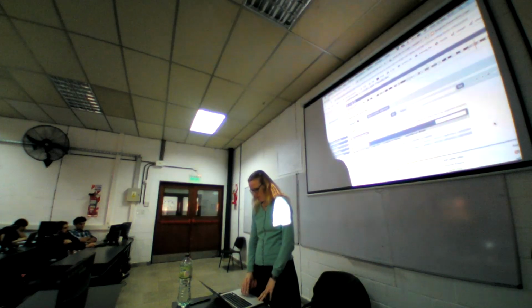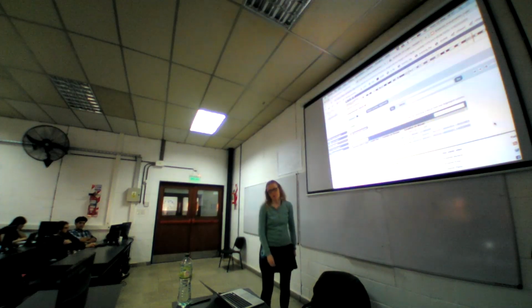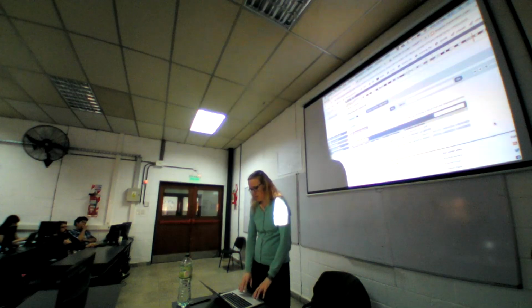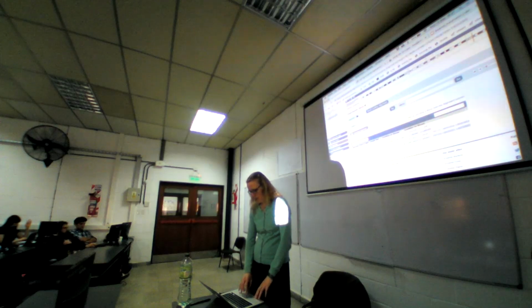And you can see that this region between human and mouse has an alignment, and it comes in 4 different blocks in this table here, of which one is the largest, and this aligns human chromosome 2 with mouse chromosome 2. So this is most likely the most reliable one.